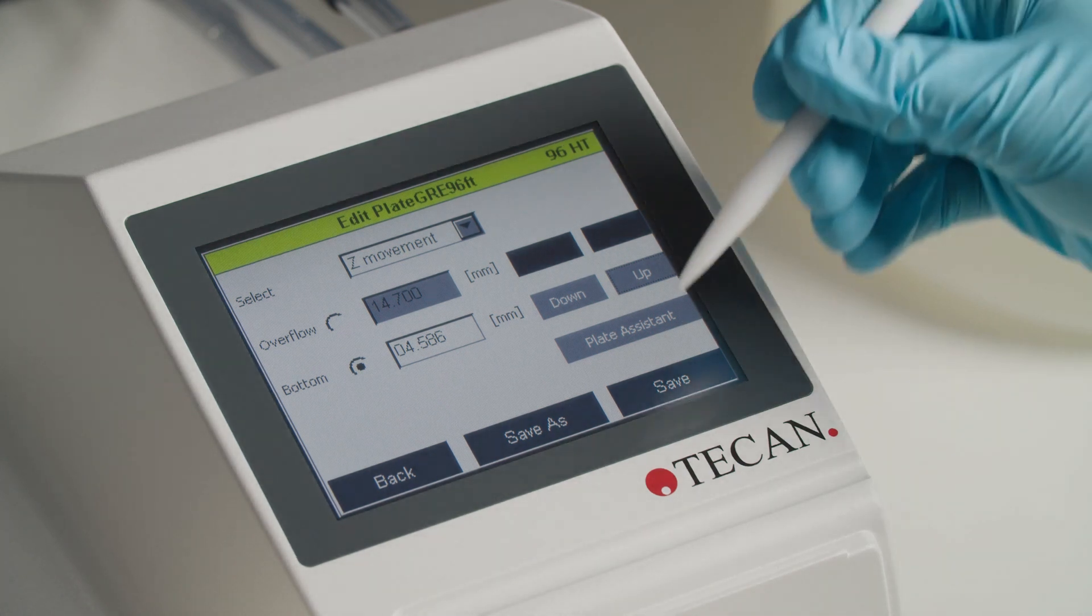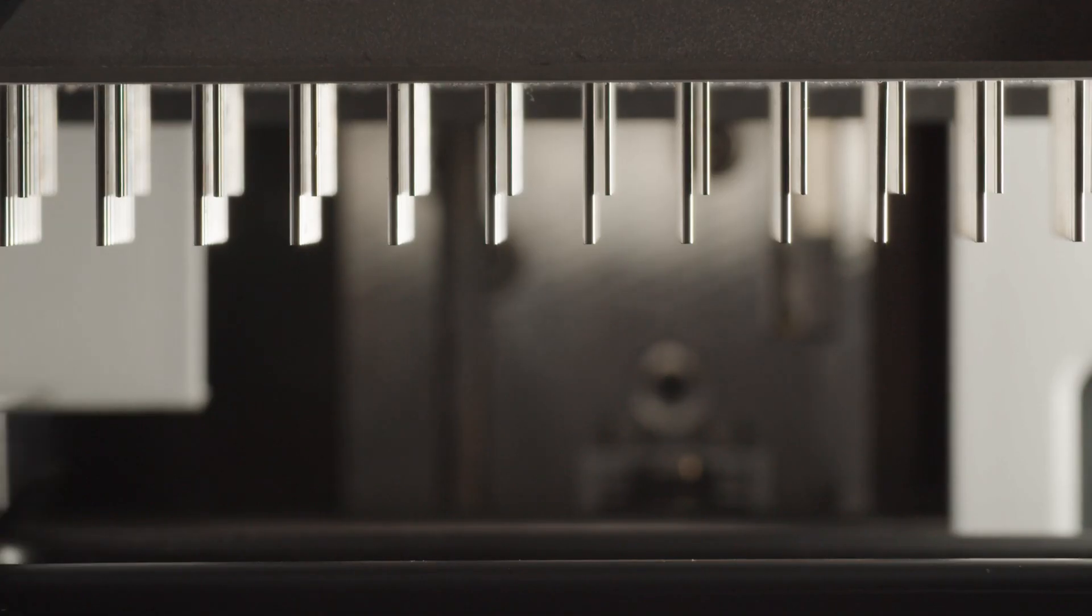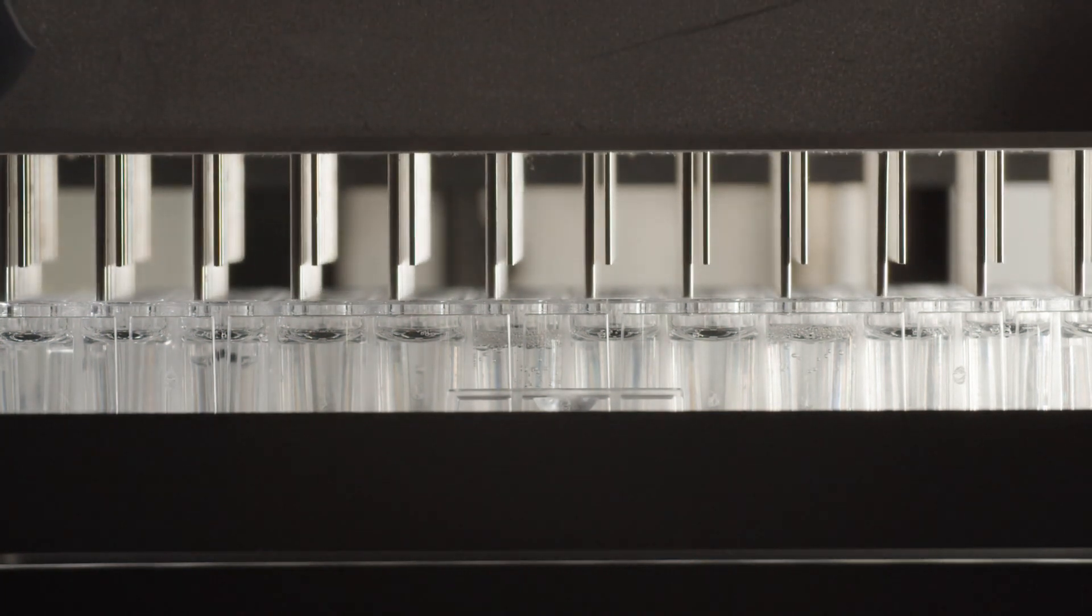When you have set all the plate parameters correctly, save the plate definition, which you can then use at any time. Please make sure to check your plate offsets when transferring plate definitions from one instrument to another.